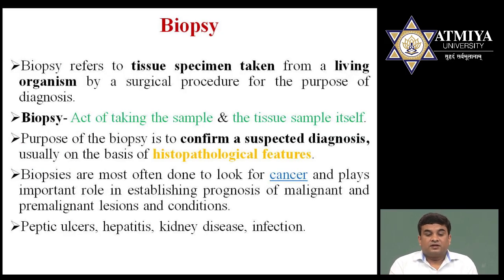So now I will speak about the biopsy. This is the most commonly used sample in the histopathology laboratory. It is a tissue specimen taken from a live organism. If you collect any tissue sample from any living organism, this is called a biopsy.